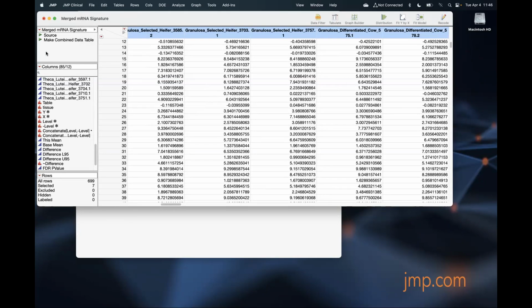It would become its own data set. You'd have to have this one enormous data set and then try to do that comparison. But if you're going to do a phylogenetic type analysis, this would not be the right tool for that. It's not like QIIME, for example, which would be a much better tool for those kinds of microbiome analyses. But if you get the OTUs out, then you're going to go back into your statistical analysis, and this would be the right tool for that.